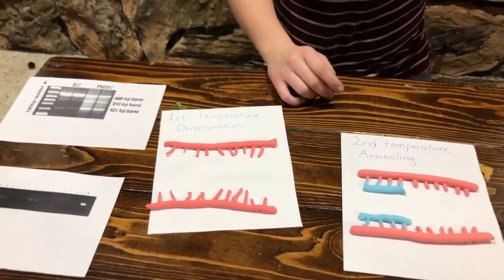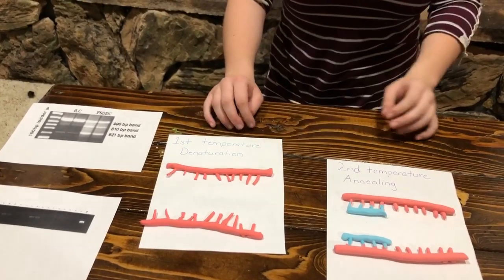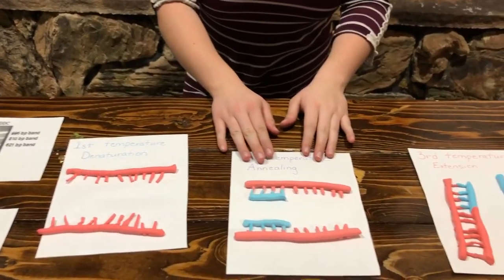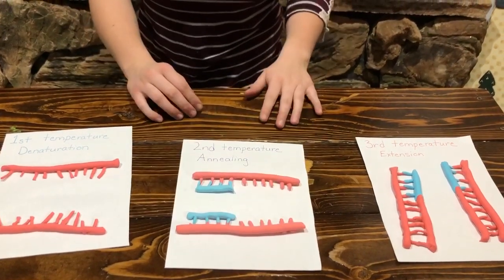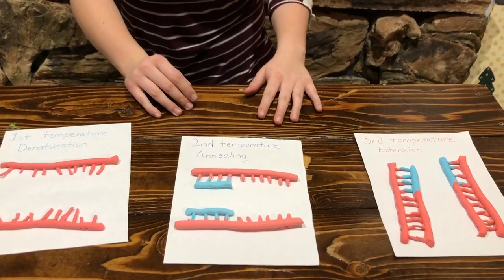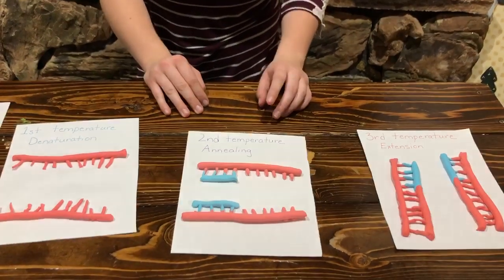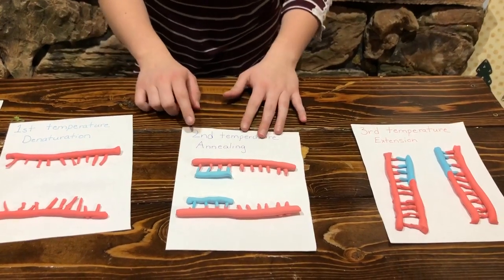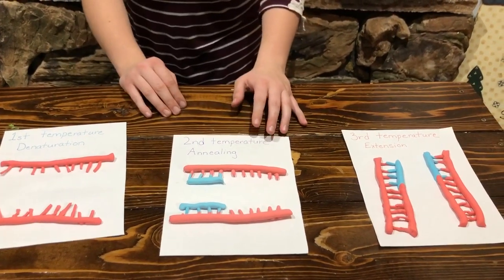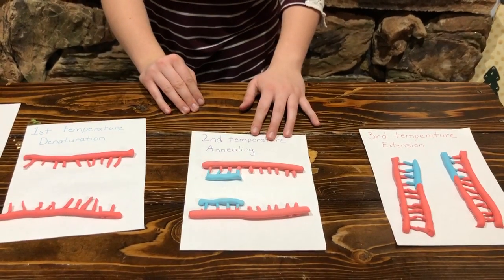The breaking of DNA is known as denaturation. Then it cools back down so that the specific primers can attach to the separated DNA pieces. These specific primers are designed according to the target DNA sequence in their experiment by the individual scientist. This process is known as annealing. To anneal the primers in the target DNA sequence, they must have a complementary sequence.